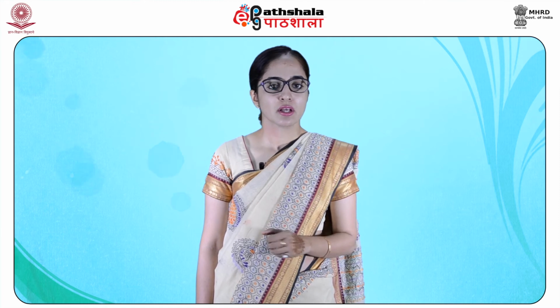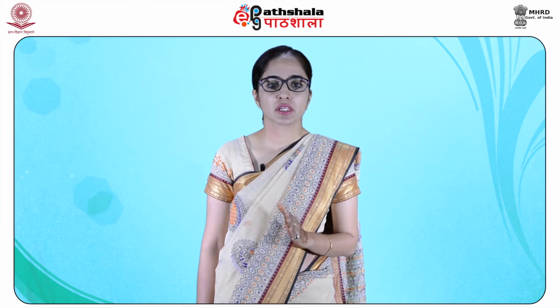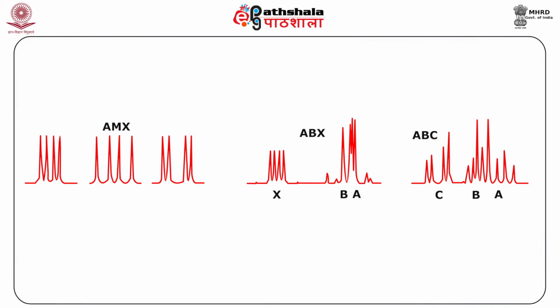Similarly, students, the hydrogen HX is split into a doublet by coupling with the proton HM, and then each line is further split into doublets with the proton HA. Now, all this coupling can be explained clearly by this figure, as you can see here, and the ABC system is also shown in this figure.